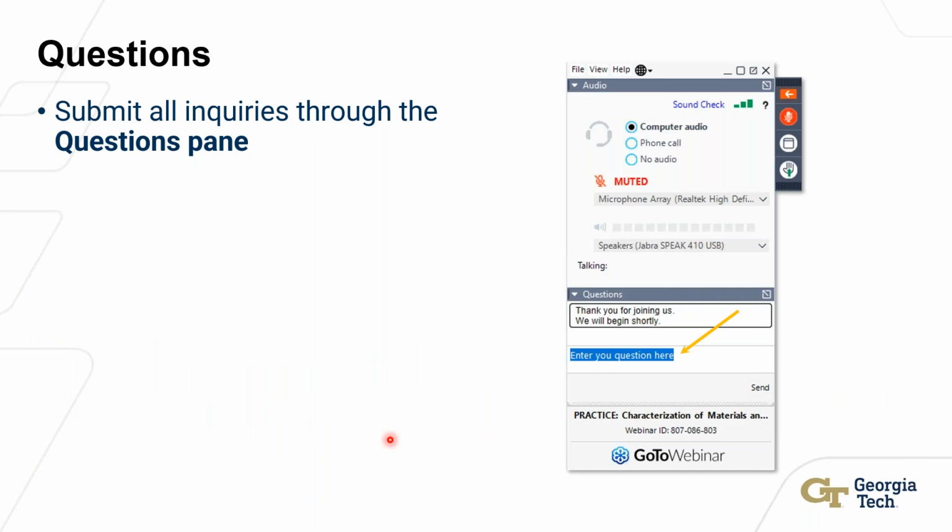I have a couple questions so far. One, how do you calculate the indexing success rate for your 4D STEM data sets? Some of them, there were some white regions that you said couldn't be indexed. How do you calculate that success rate?